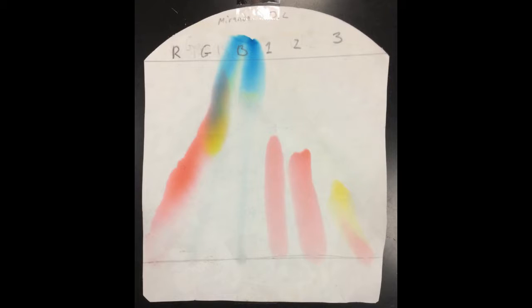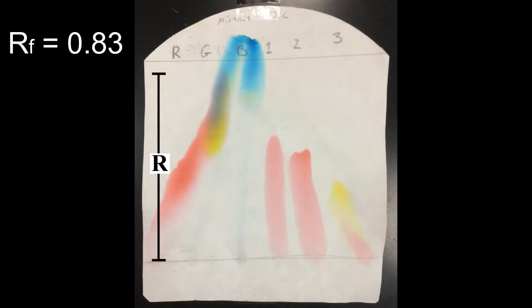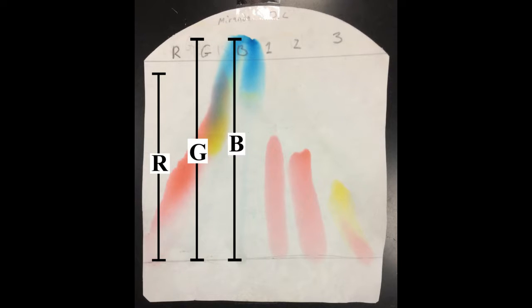When the paper was placed in water, the water was drawn up through it by capillary action. The mixtures on the paper each had a different affinity for water and moved a different distance. The red dye had an RF value of 0.83. Both the green and blue dye had an RF value of 1.